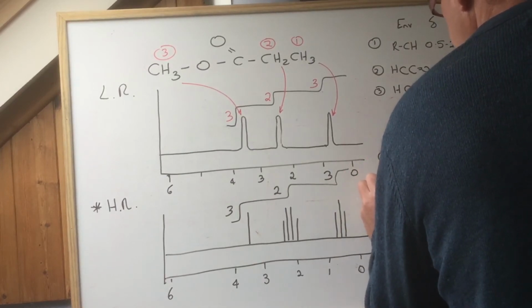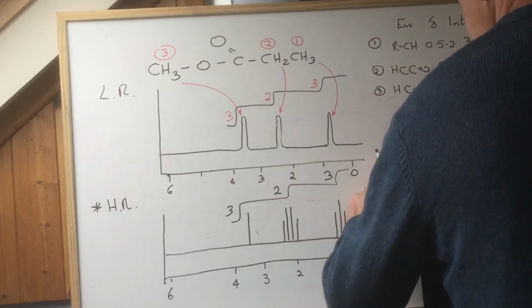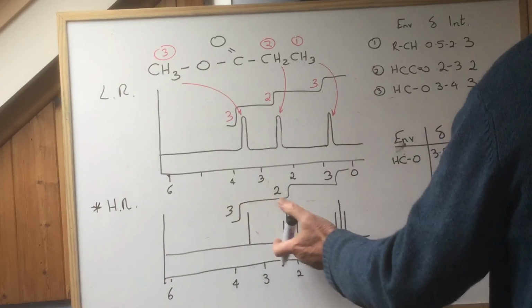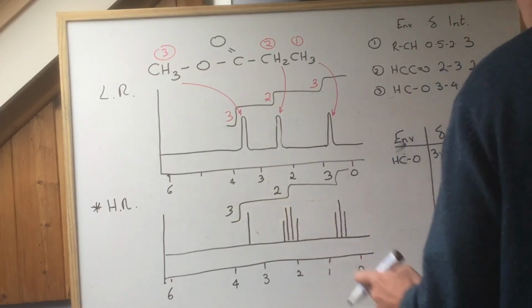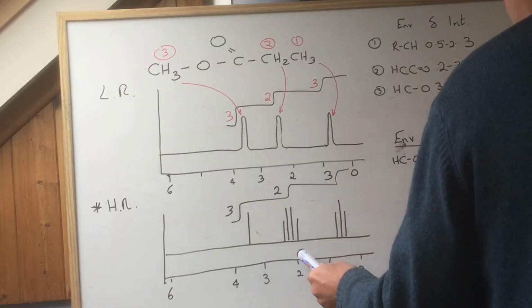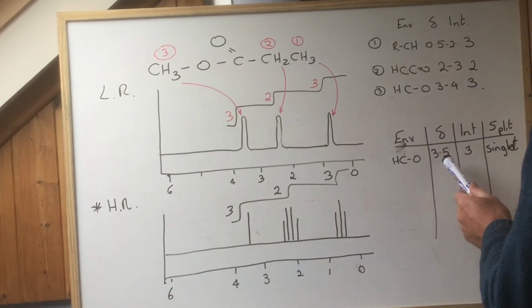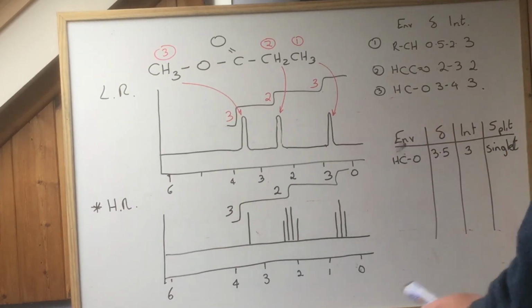Number 2. I don't want that one there, it'll just confuse you. You can go in the opposite way. Let's have a look at this one now. What's that telling me? Like I said, when you go in the other way, this is the column that you start with, the chemical shift column.